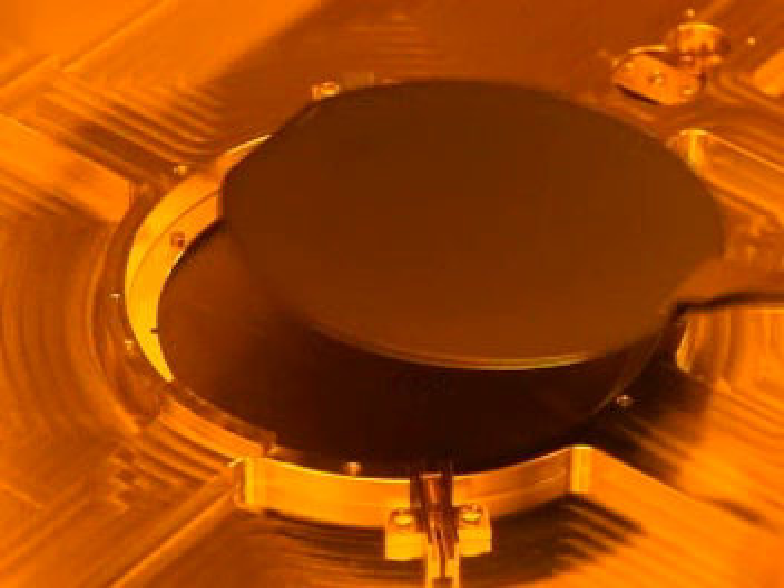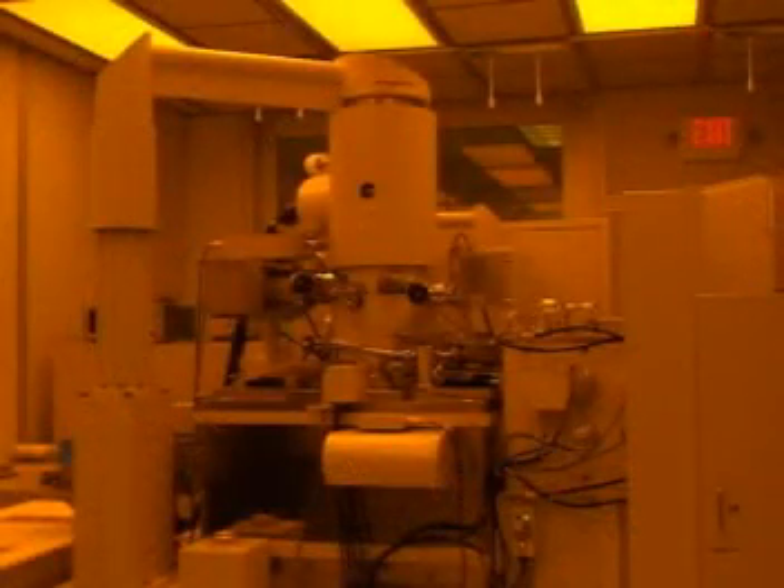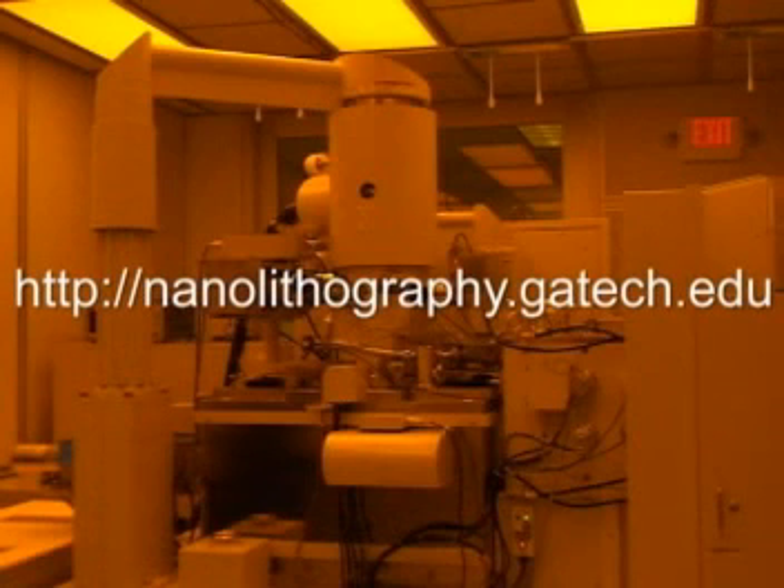For the purposes of this training video, we will be using a 4 inch silicon wafer. For more information about the JBX9300's capabilities, please visit the Nanolithography website at nanolithography.gatech.edu.